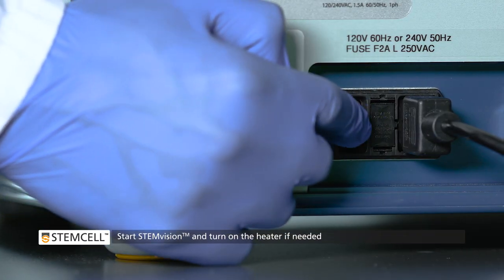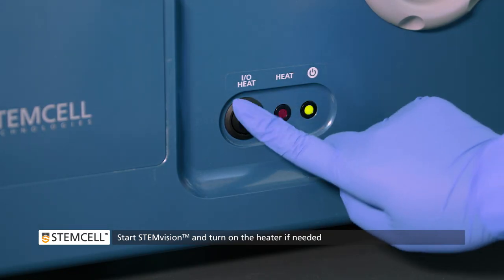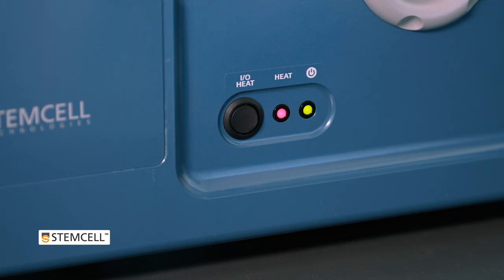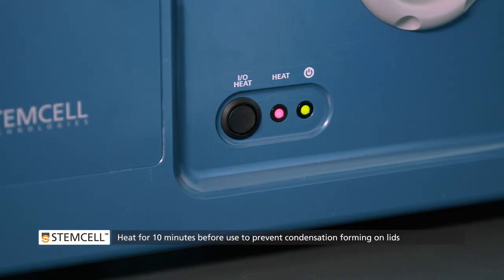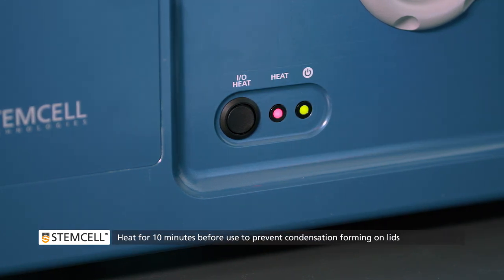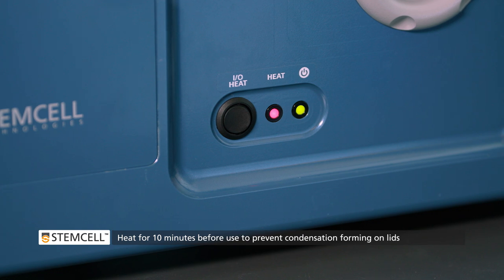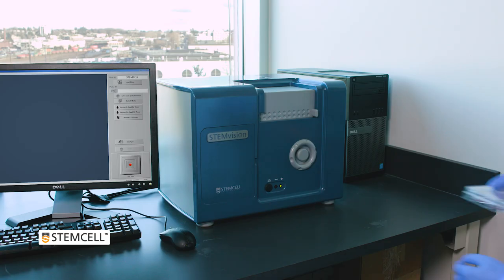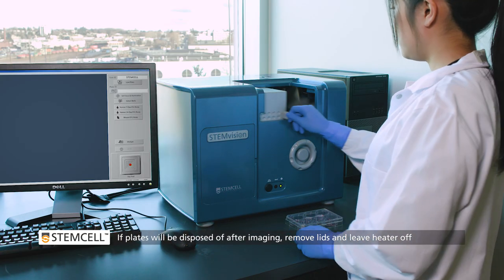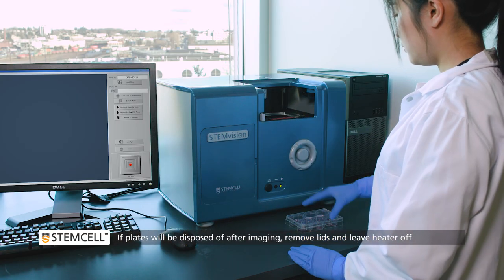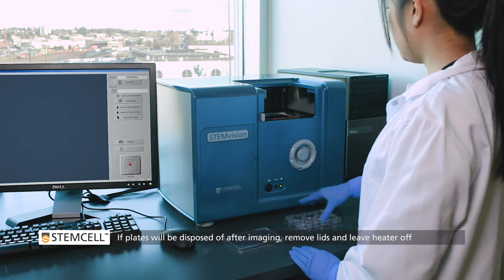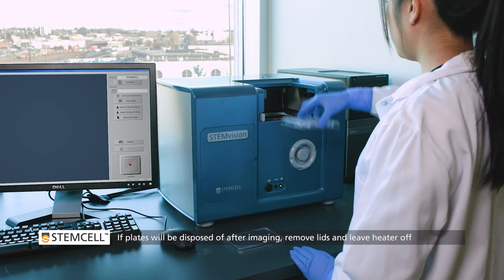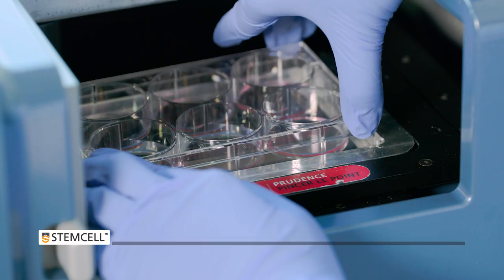Start StemVision and, if needed, turn on the heater. This warms the interior to prevent condensation on plate lids, which, if left on during imaging, could interfere with proper visualization. We recommend analyzing CFU assays without lids and no heater if the sample is to be disposed of after imaging.